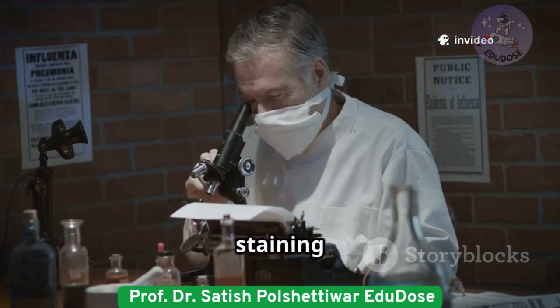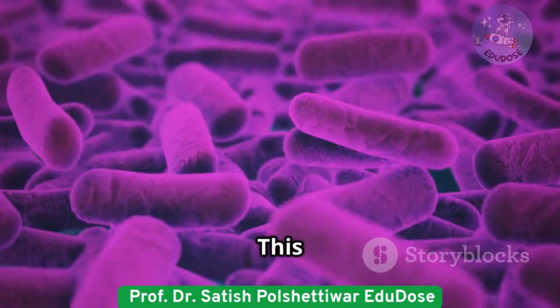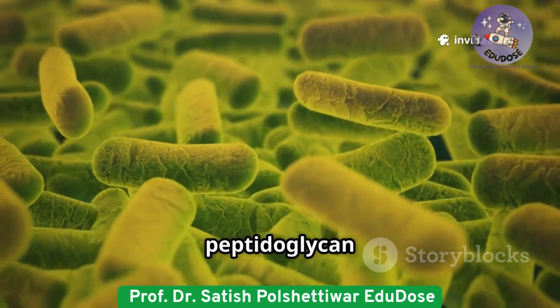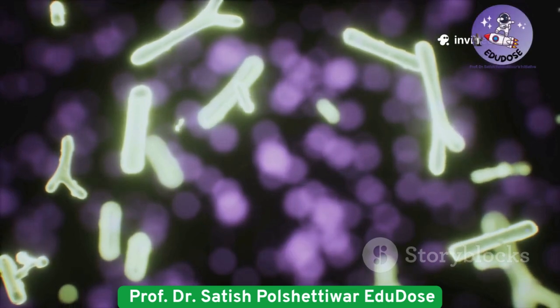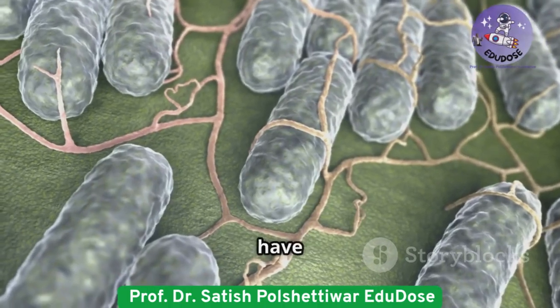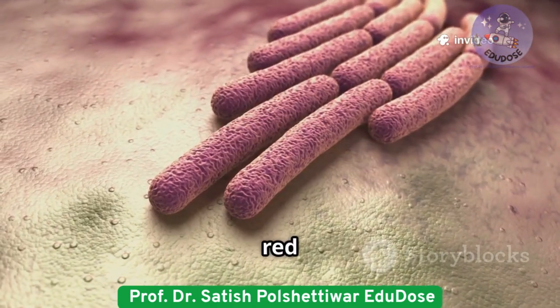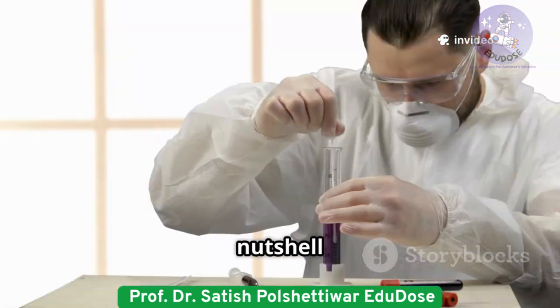Now onto gram staining, invented by Hans Christian Gram back in 1884. This classic technique separates bacteria into two big groups. Gram-positive bacteria have thick peptidoglycan walls, hold onto the crystal violet stain, and look purple, like Staphylococcus aureus. Gram-negative bacteria have thinner walls and an extra membrane. They lose the crystal violet and pick up safranin, so they look pink or red. Think E. coli.